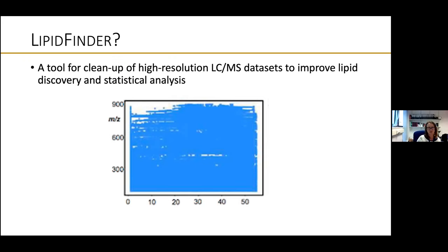I think it's fine if you've got defined mass lists and you know the retention times and you know what you're looking for. But when you don't, and when you want to clean it up, get rid of junk and look for new things, you have to have ways to do that, that really think about what the artifacts are and how you remove them.